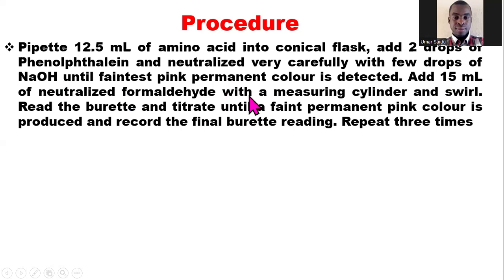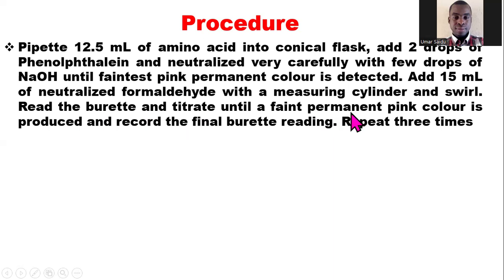After detecting the faint permanent pink color, we measure 15 mL of neutralized formaldehyde using a measuring cylinder and add it to the solution in the conical flask. We swirl to mix well, check the burette reading, and continue the titration until we again obtain a faint permanent pink color. We then record the final burette reading.